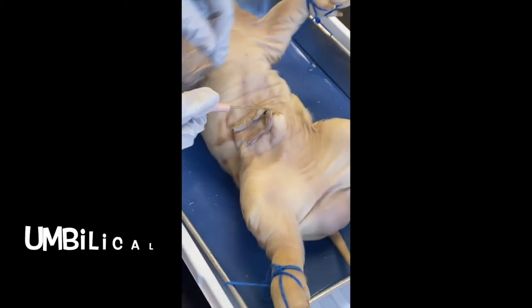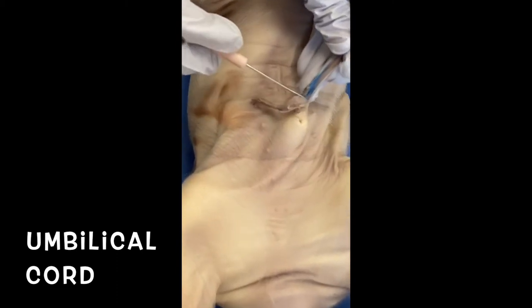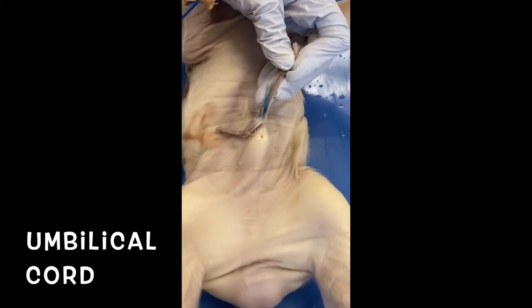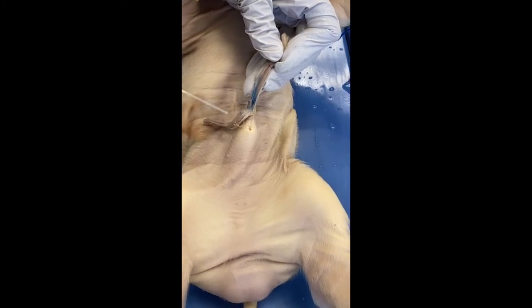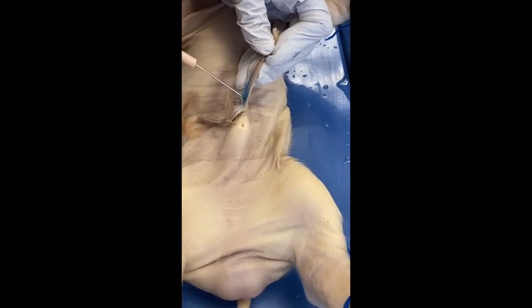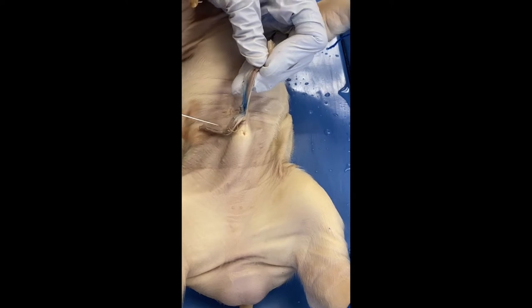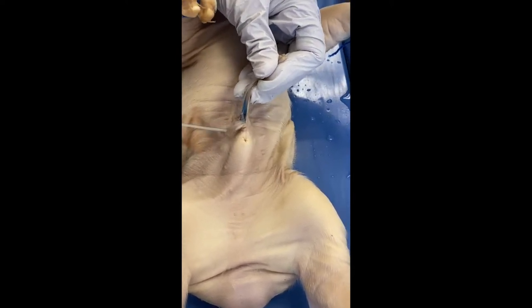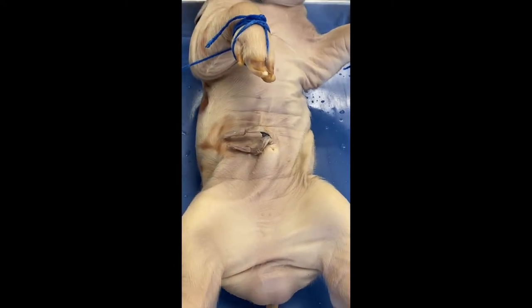The umbilical cord is important. Here you're going to notice when we dissect, you're going to see blue coloration for the circulatory system and red. Anything that you see that's in blue is a vein. Arteries will be dyed red. So you'll see that when we go in. I think we're all good for that part. Session 1, done. We're rolling.